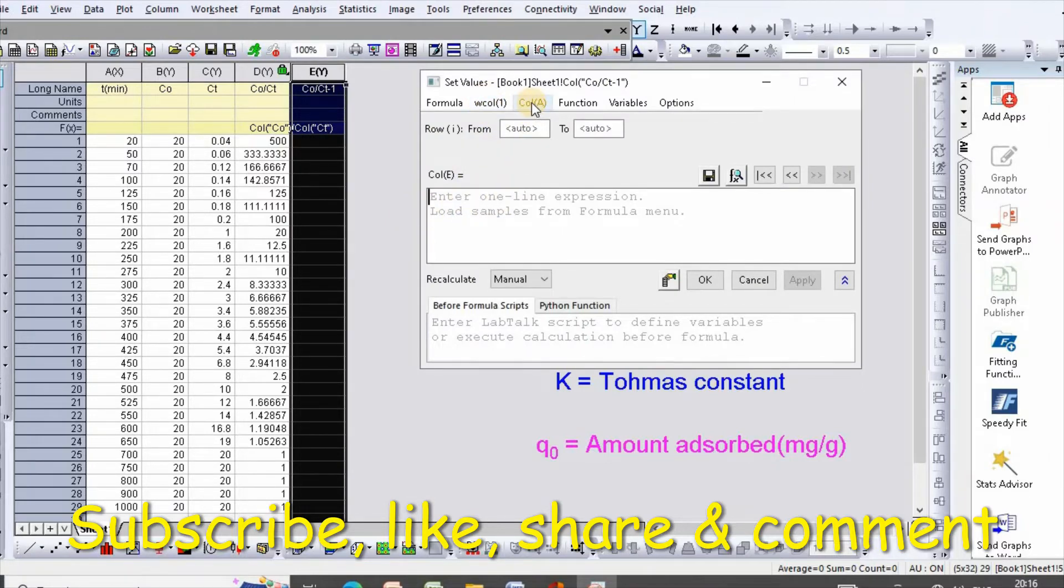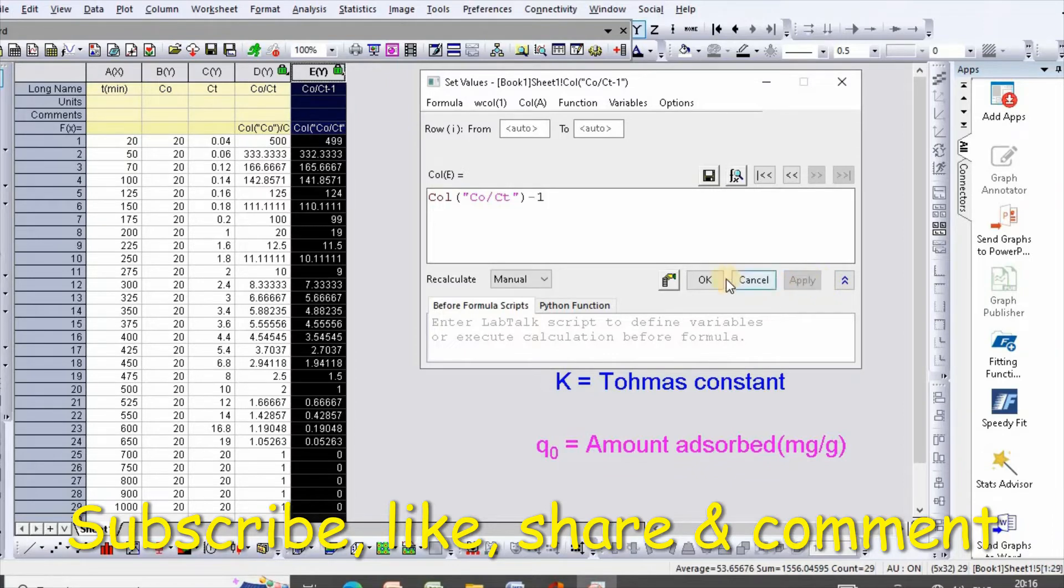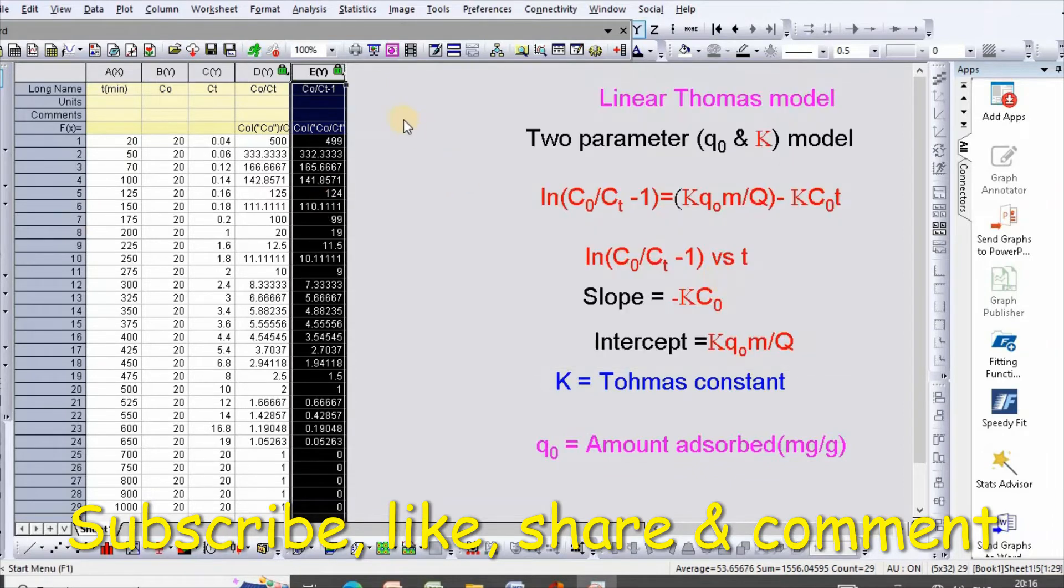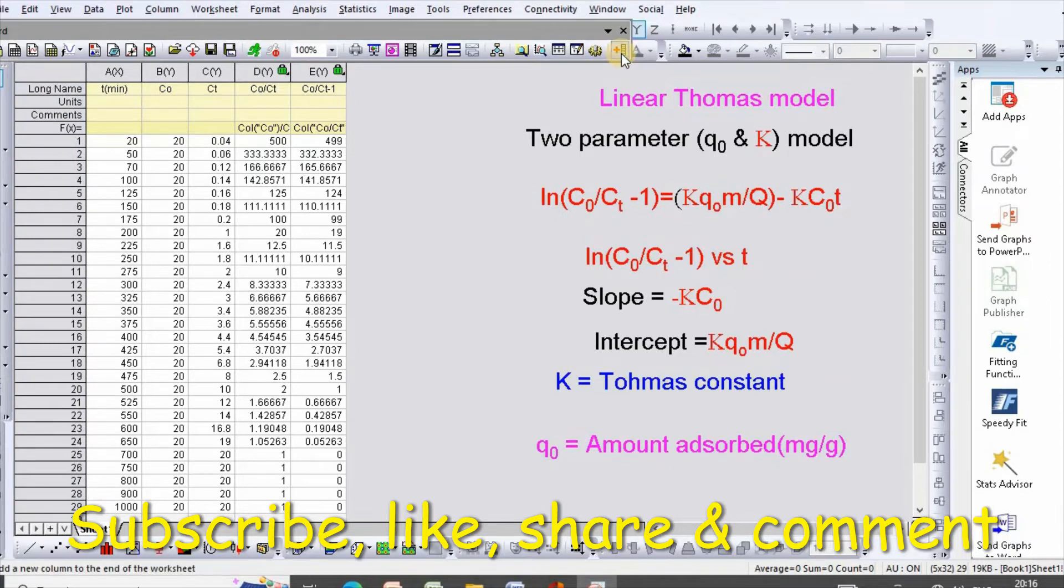Column t minus 1, apply, then update, then insert a column. Then you need to take ln(C0/Ct - 1).